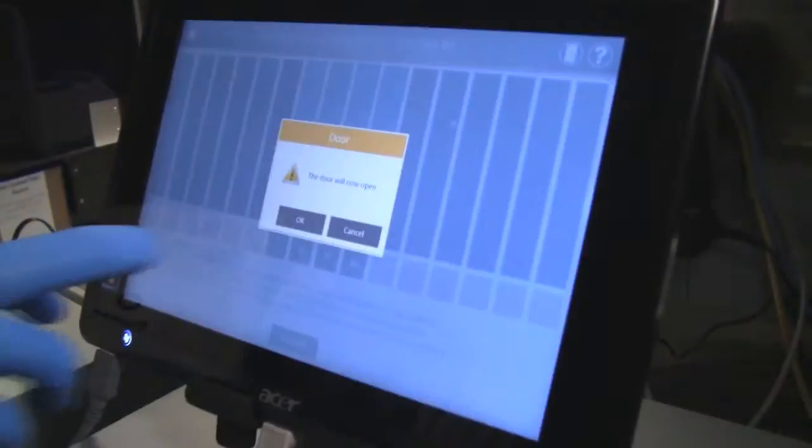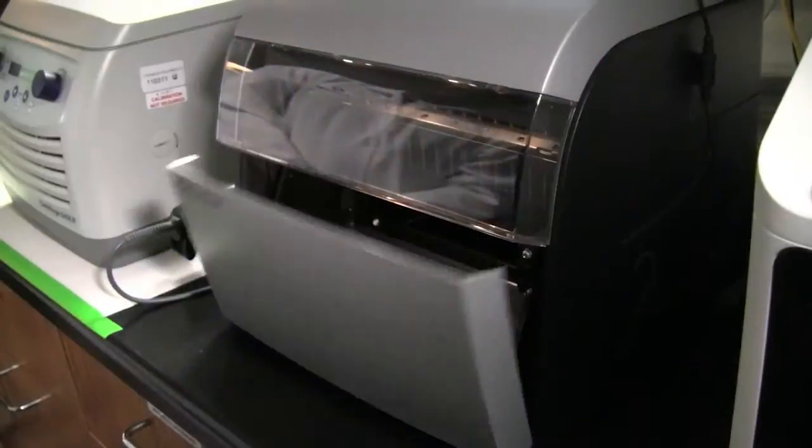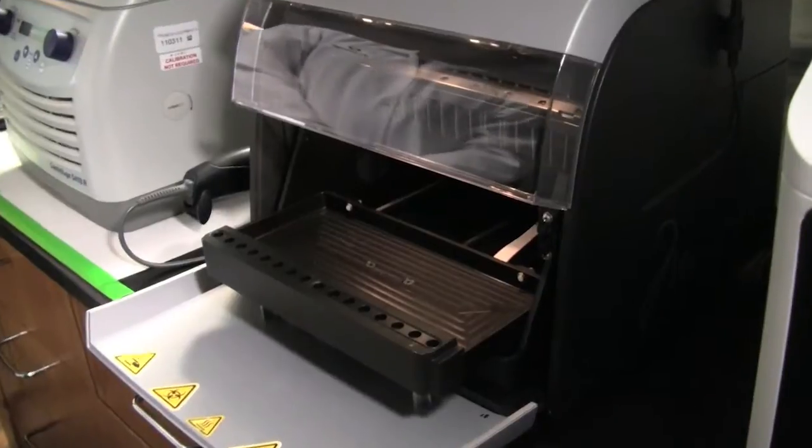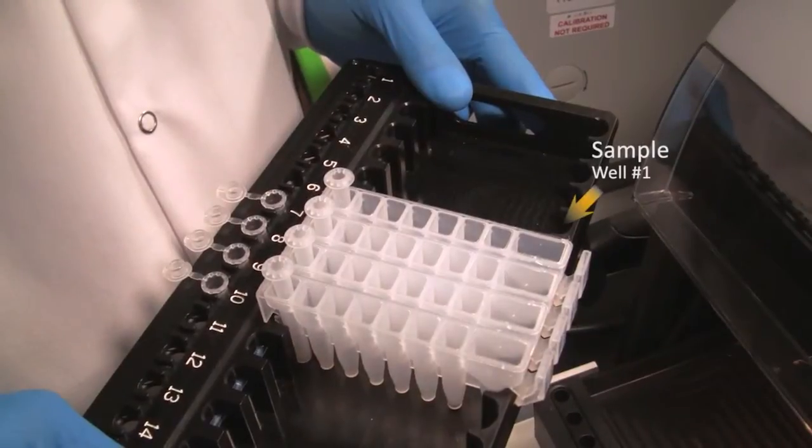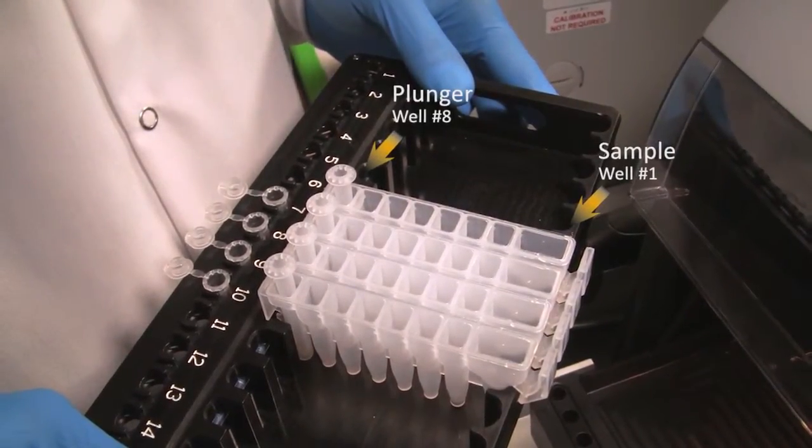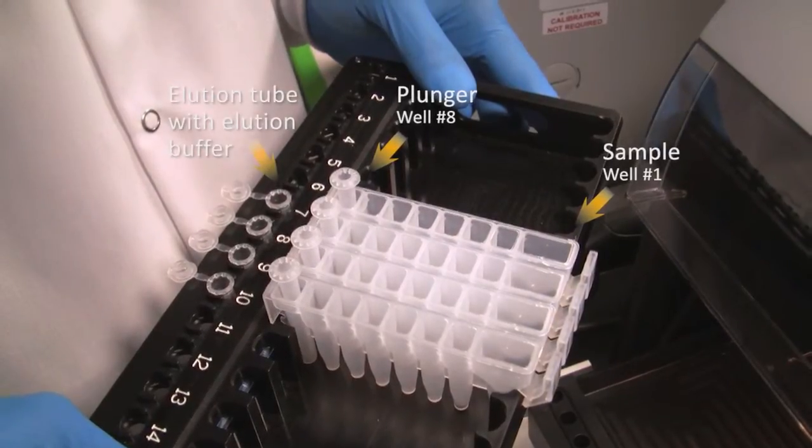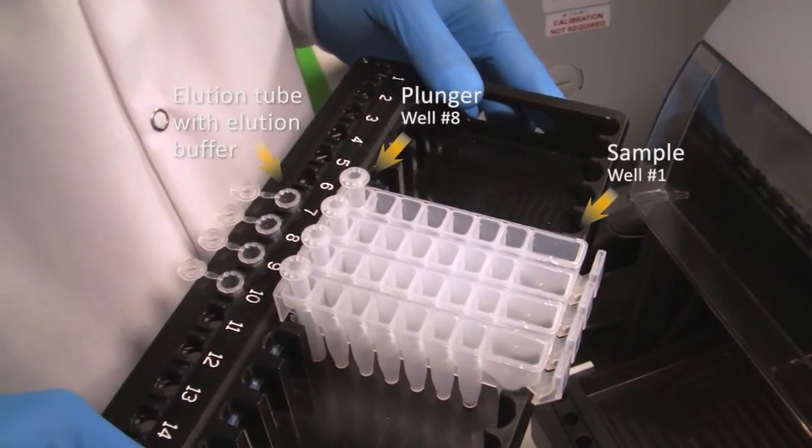The door will automatically open. Check the cartridges to make sure that sample has been added to well number one, a plunger has been placed in well number eight, and an elution tube with elution buffer is in place.